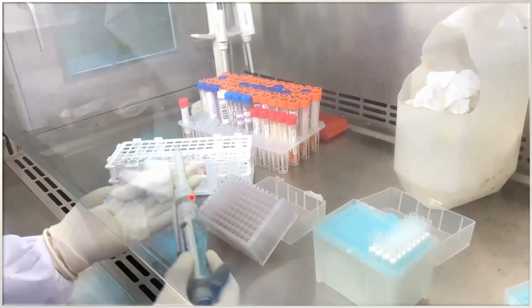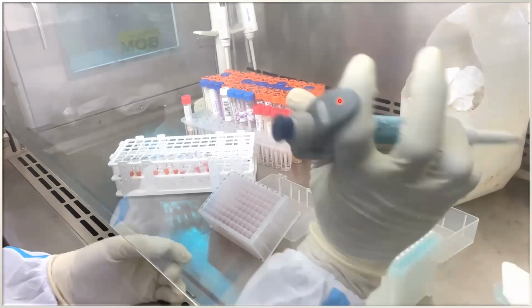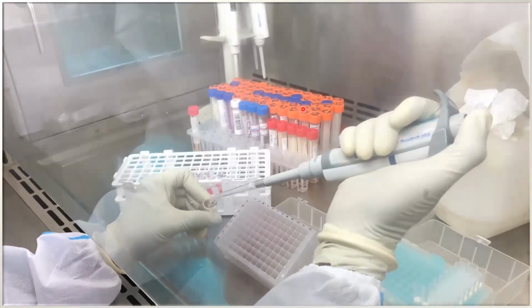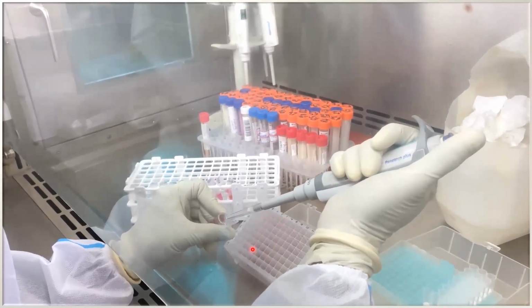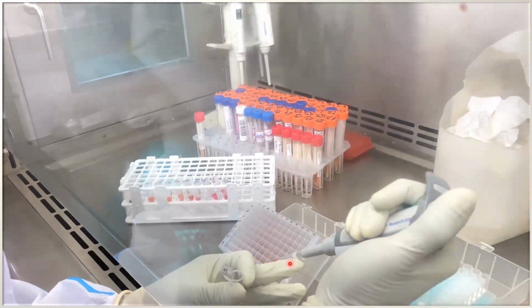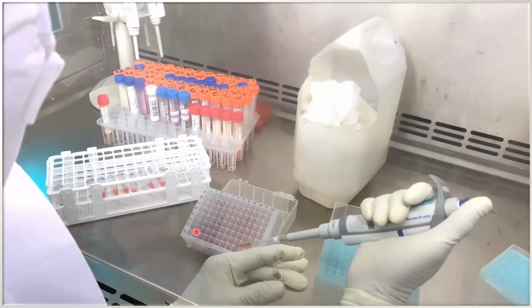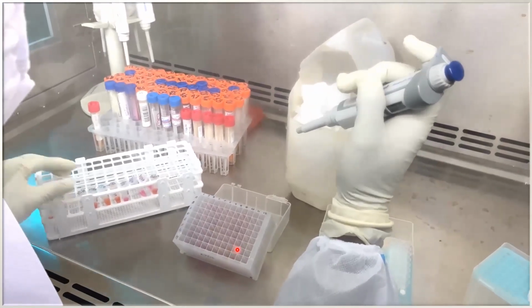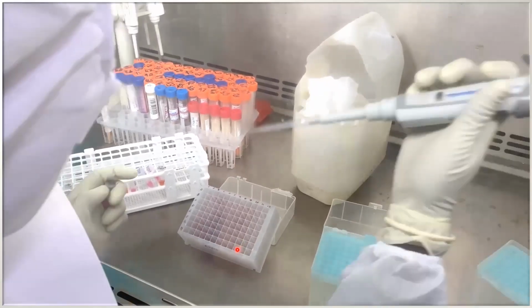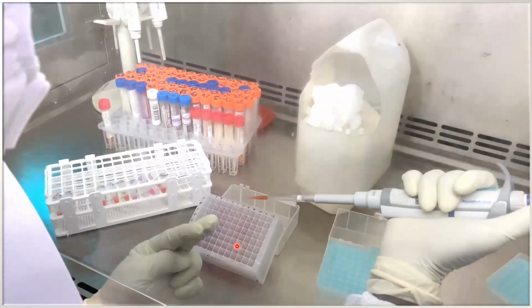So this video shows you how these VTMs are arranged inside a BSL-2 laminar flow. What we see here is VTM being poured into these small chambers. These are 96 well chambers where we have already put a buffer called the viral lysis buffer. Now we are adding the viral transport media. This viral transport media is very essential because it might be containing, or might not be containing, the virus, whereas the lysis buffer inside will help the viral nucleic acid to come into solution.